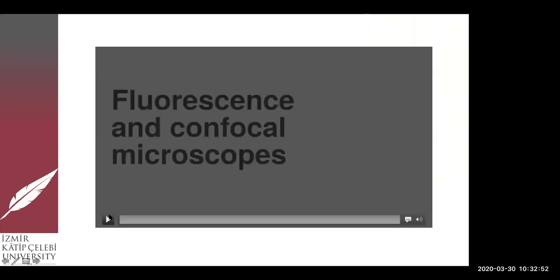Here, I'm going to show you a small video. It is a 2-minute video which shows the difference between fluorescence and confocal laser light microscopies.